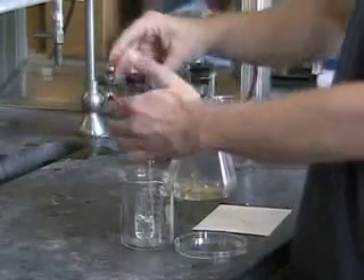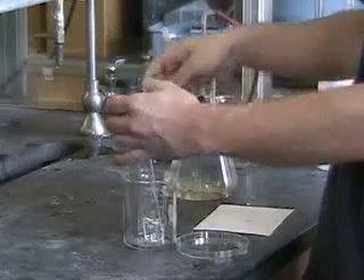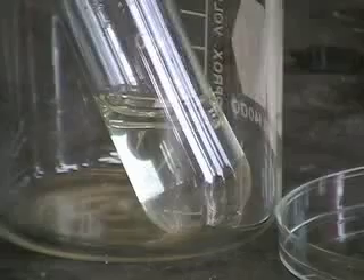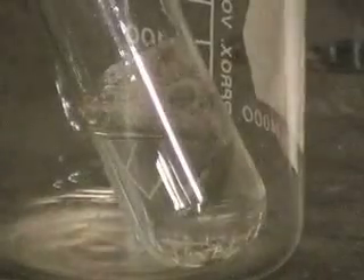The capsule is put into the acid and the sidearm test tube is quickly stoppered. The acid slowly dissolves the capsule and exposes the alloy. The reaction then occurs, producing hydrogen gas which exits the test tube and goes into the sidearm flask.